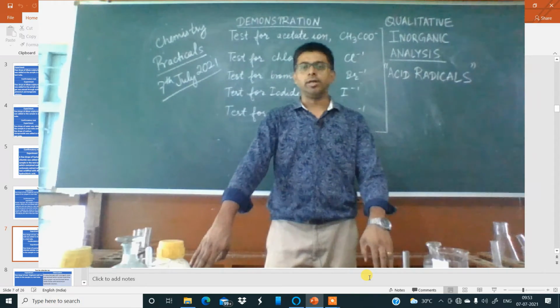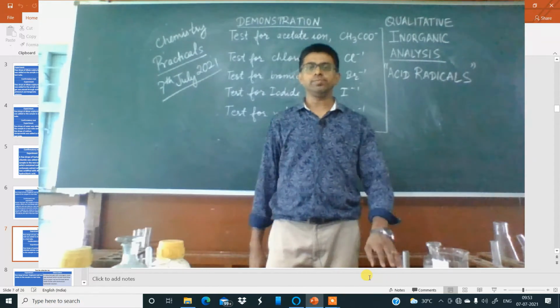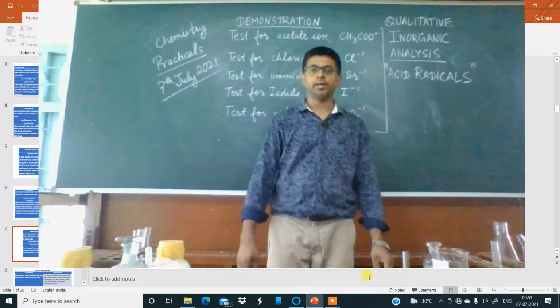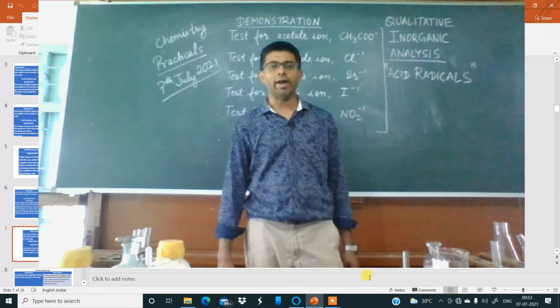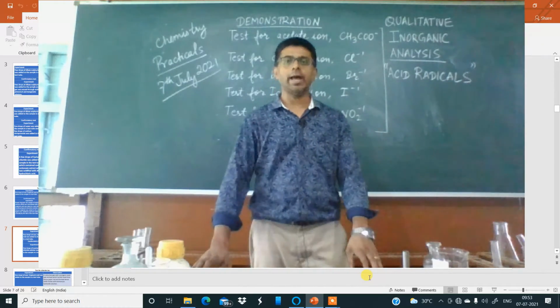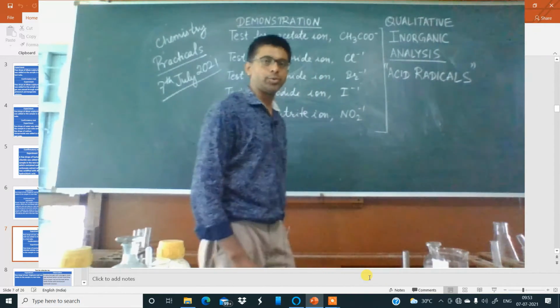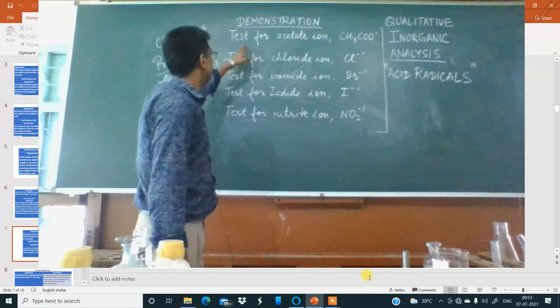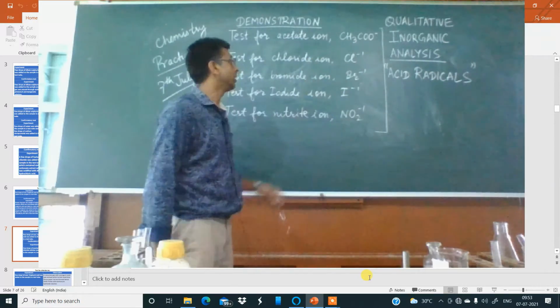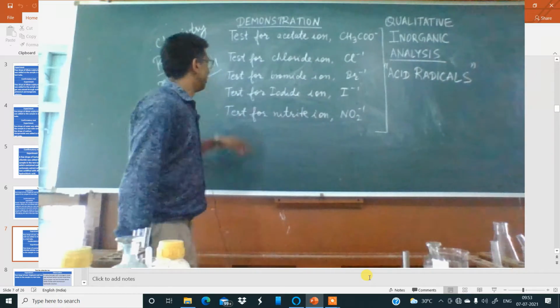So look at the test for acetate ion. For today's demonstration class practicals, 7th of July 2021, I have explained and shown you the test for acetate ion, test for chloride ion, test for bromide ion, test for iodide ion and test for nitrite ion. This is the second day of the demonstration class which I have shown you. So you can watch the video. I am editing the video and I am giving you the sound for understanding the various steps which I have shown you today in the chemistry lab.